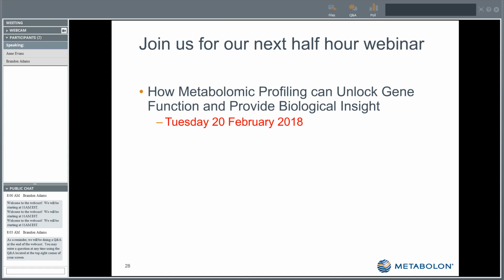Some of the things we're discussing are providing all of the quality control data to our clients so that they can publish that along with their experimental data to show the quality of the platform. We're also in some early phase discussions to provide the raw data, where some of the high-end tier journals are now requiring access to the actual raw data as well. So we're in early discussions on how we can provide that data to check off some of those publication requirements.